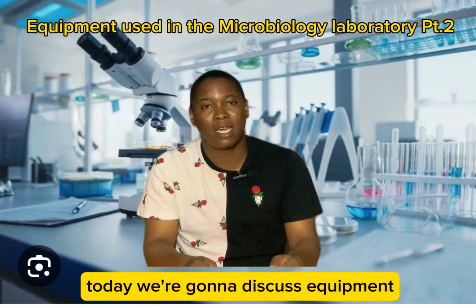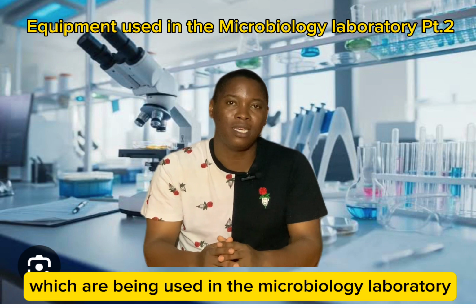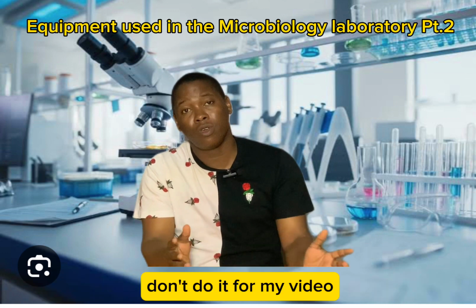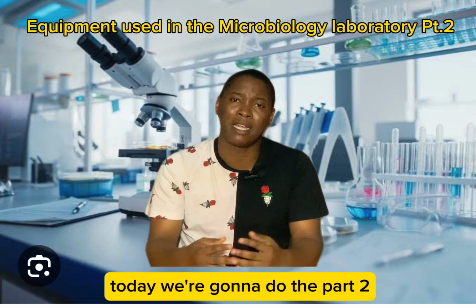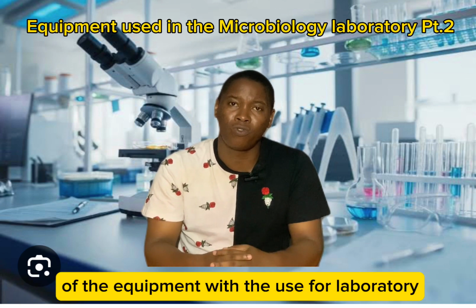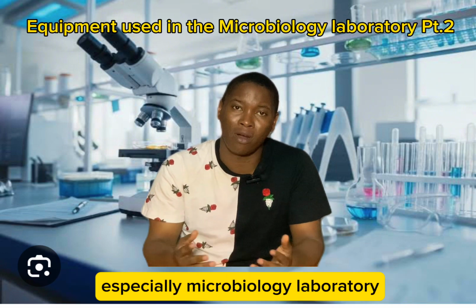Today we will discuss equipment which are being used in the microbiology laboratory. We don't do a formal video where we've done the part 1 of these equipments. Today we will do the part 2 of the equipment where they use for laboratory, especially microbiology laboratory.